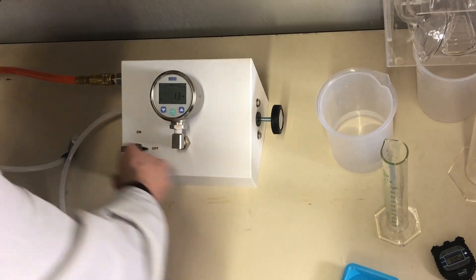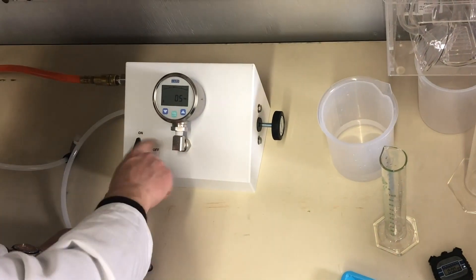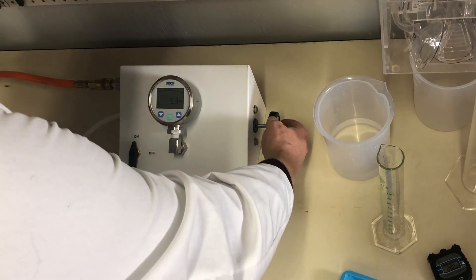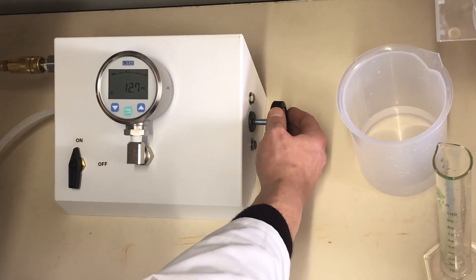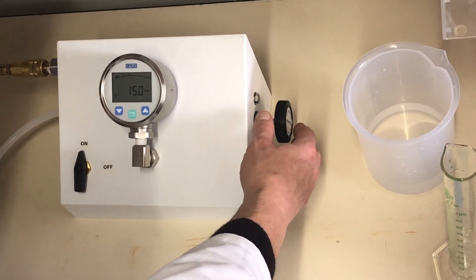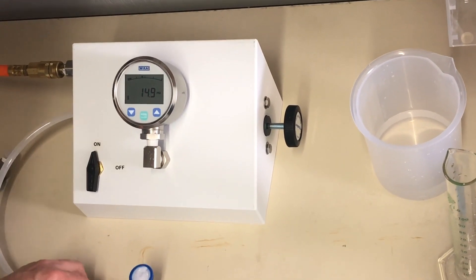First we'll turn the switch on. It does trap a little bit of air in the leg. Then we'll turn this up to 15 psi. Then we'll allow that to sit for a moment — it's approximately 15 seconds.